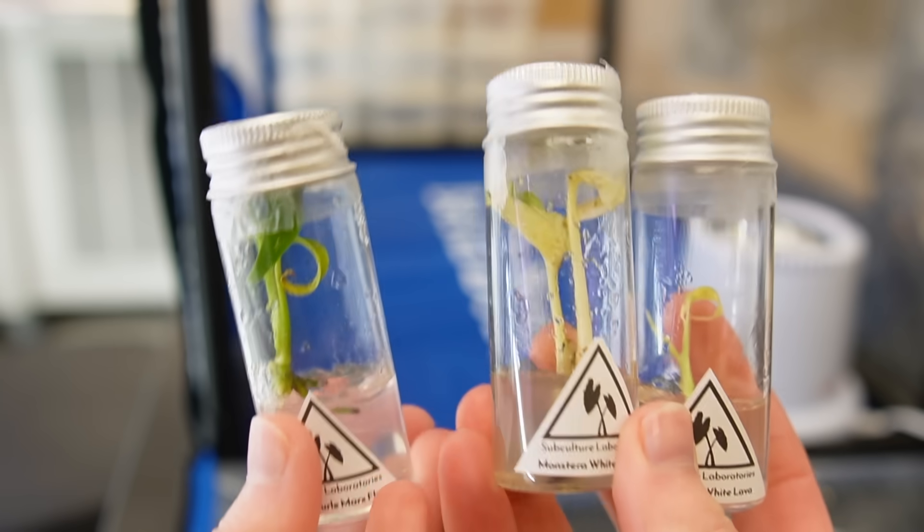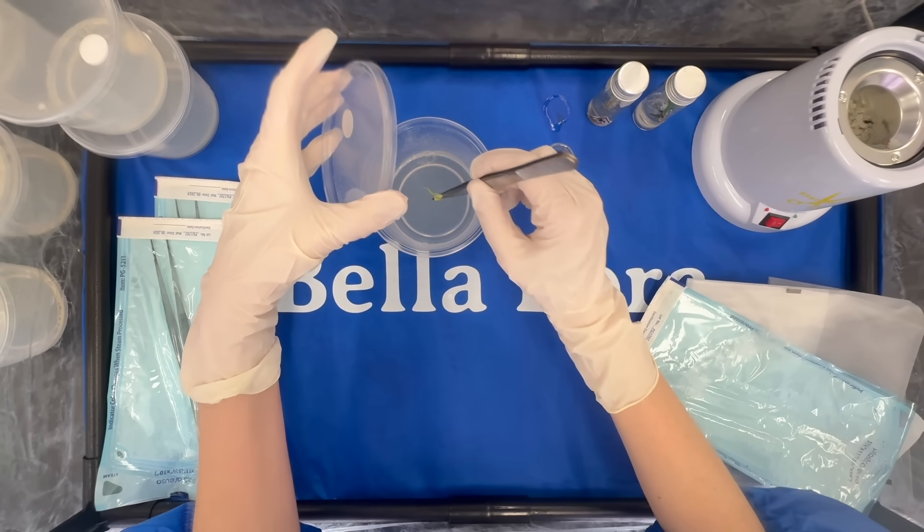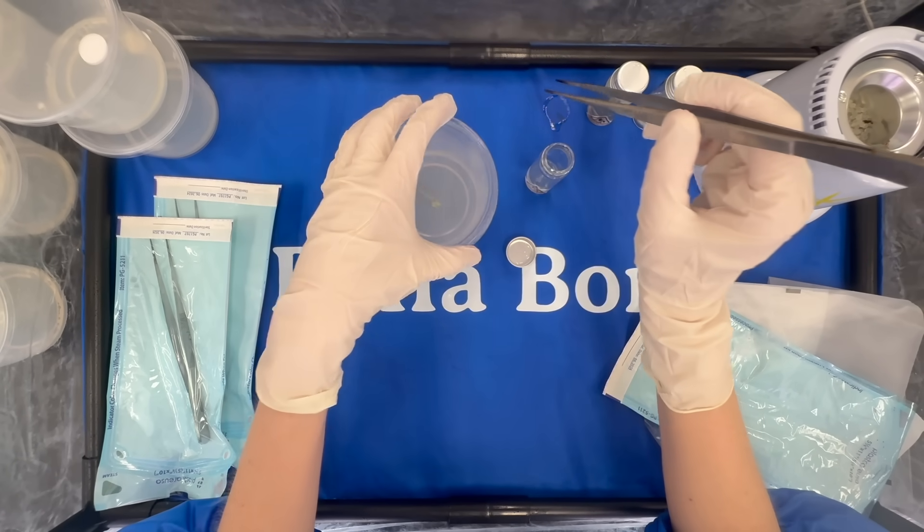The price has gone down for Mint Monsteras since I purchased the initial one. It looks like they sell for about $50 each, so that leaves me with around $600 worth of plants. If you buy a plant that's already in tissue culture, it's very easy to make clones of that plant at home, and today I want to show you how.